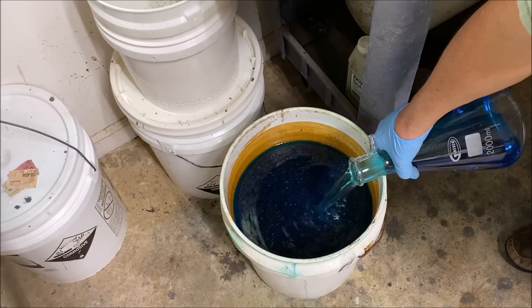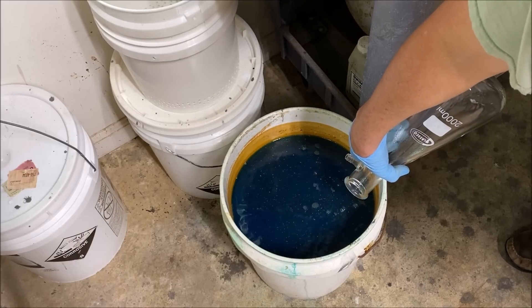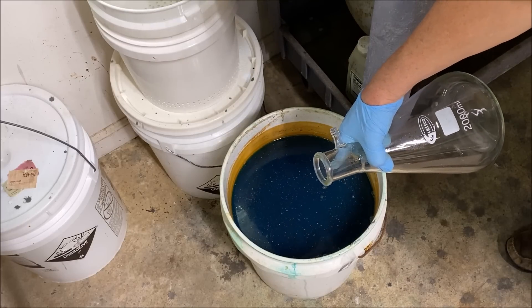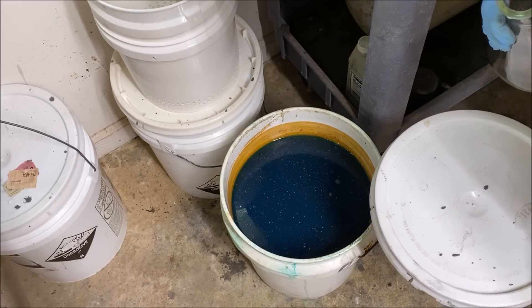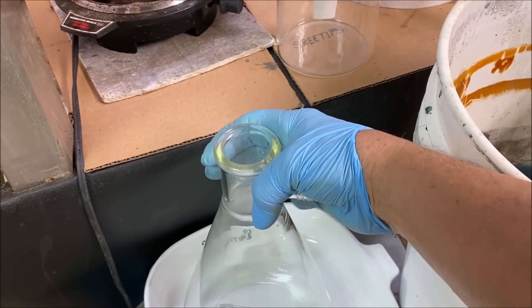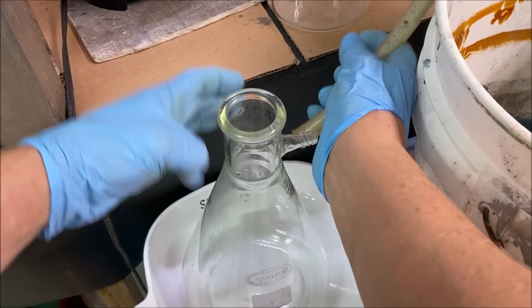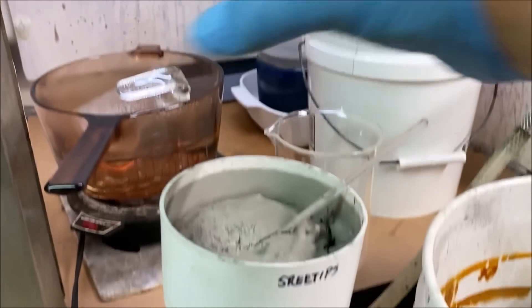If there's any silver or other precious metals in this blue liquid, it will cement out on the copper in the bottom of the bucket. Then I'll take this blue liquid and add it to my waste treatment bucket that's full of angle iron, and cement the copper out as part of the waste treatment process. Once the flask is rinsed out, we reconnect the vacuum line and get our funnel with the silver back in place to continue rinsing.